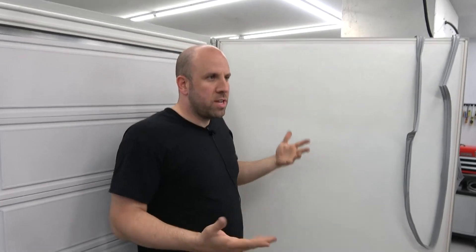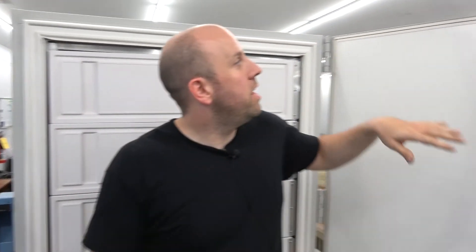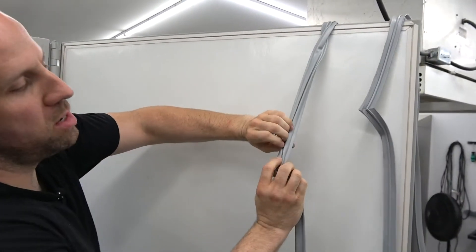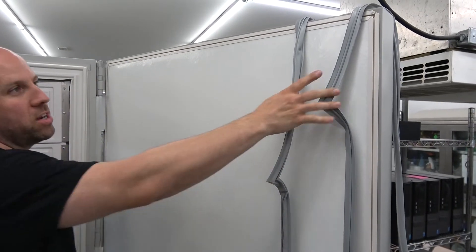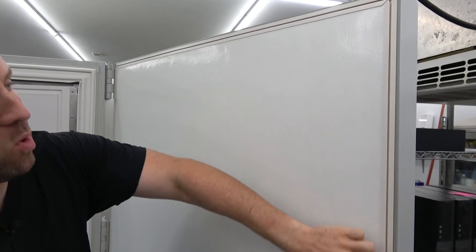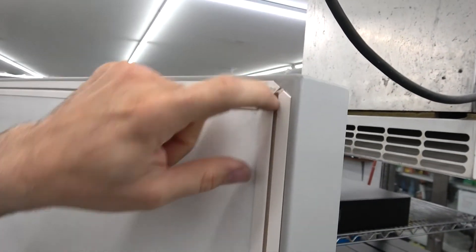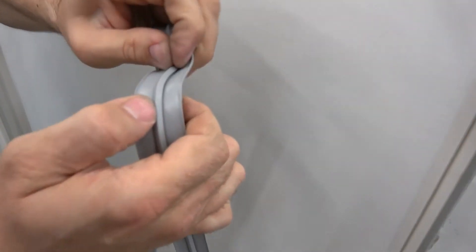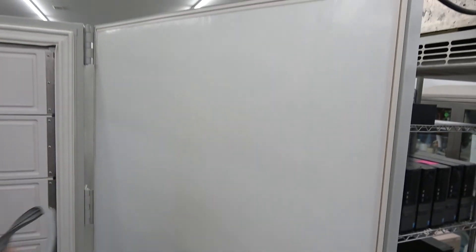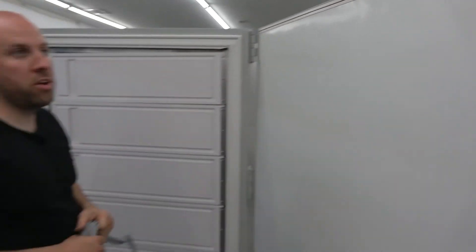This freezer has two seals inside and then a single seal on the outside — well, it's kind of a double — but it has a seal on the outside as well. That outer one comes off and goes on the same way; it's just one single channel, so it's even easier. I would just dab a nice little glob of silicone in that gap at each of the four corners, then do the same thing — put the piece into the channel, close the door, keep pressure on it, keep it latched for 24 hours, let everything dry and seat, and then you're good to go ahead and use your freezer.